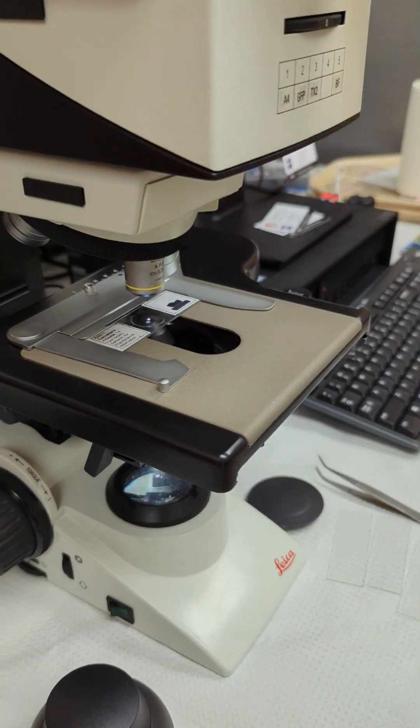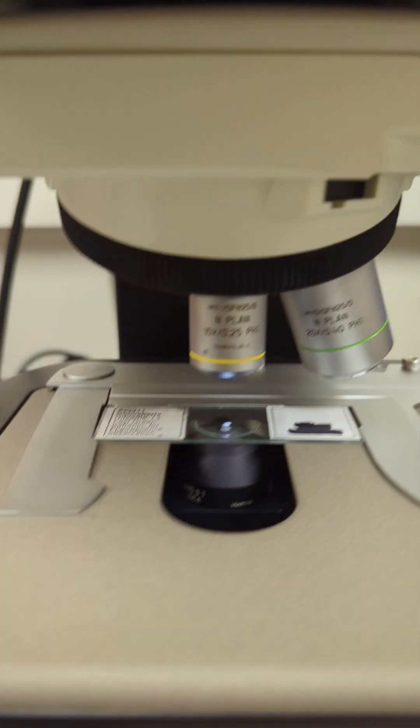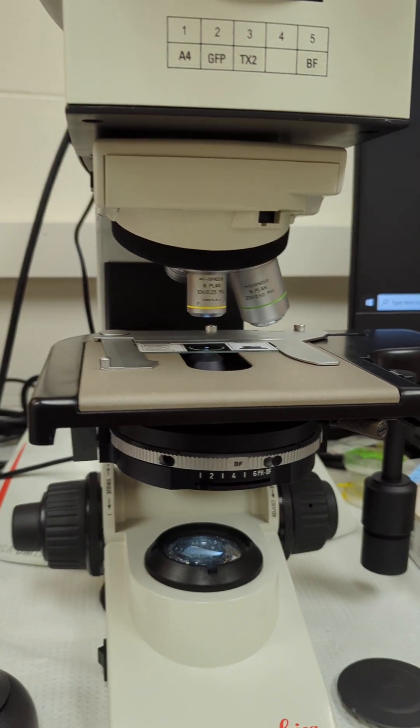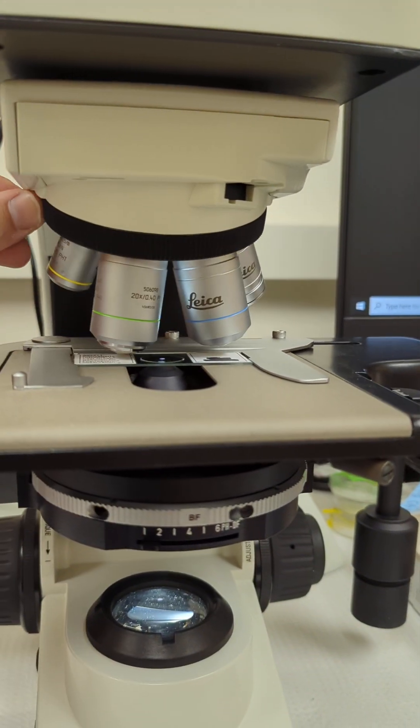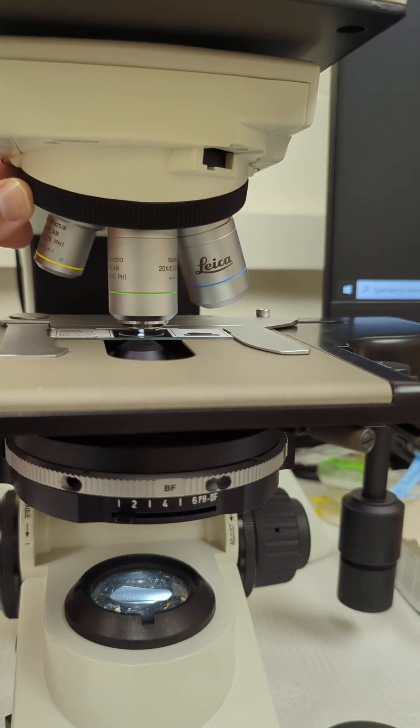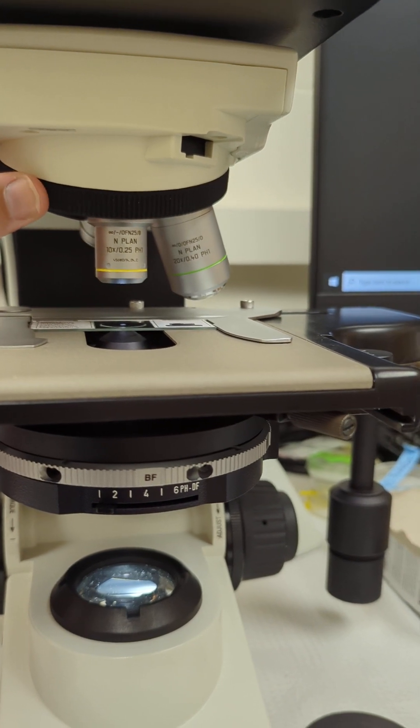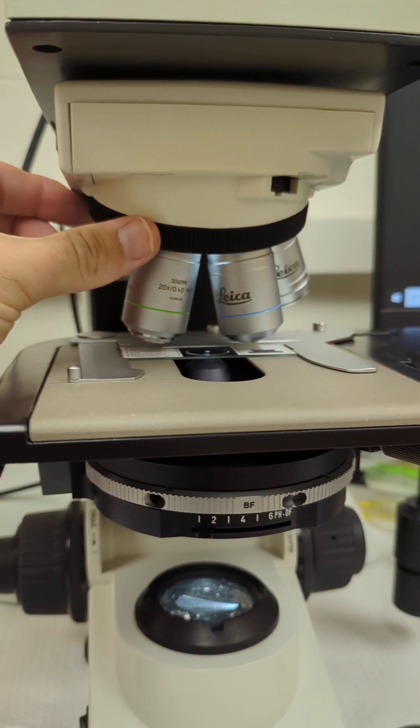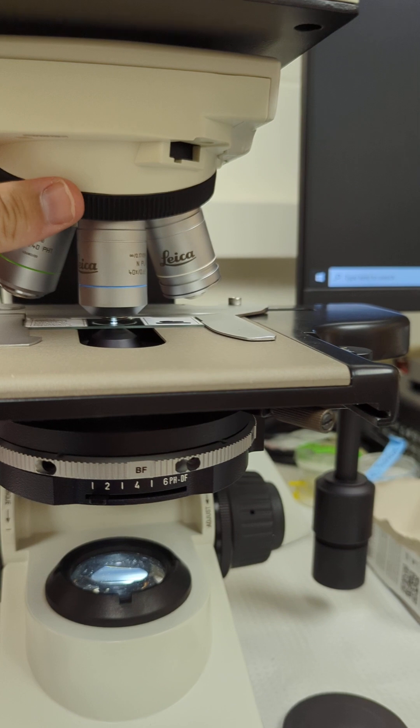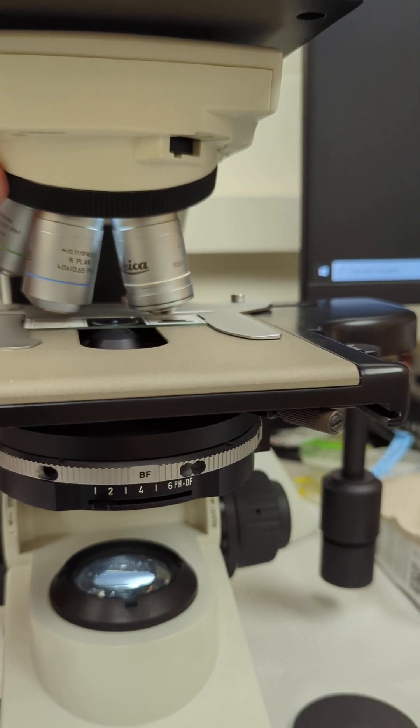Coming down, we meet the stage, and you'll have your objectives, obviously, just like any other microscope. So your objective turret, just like any other microscope.